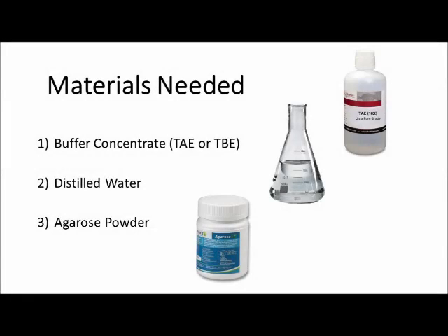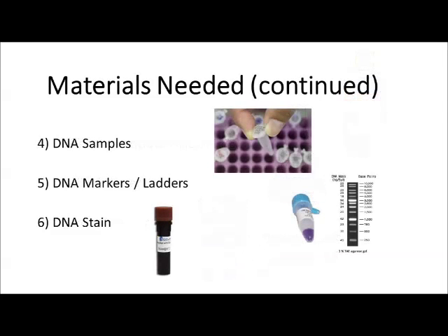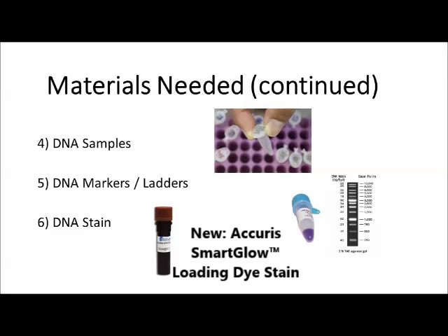Materials needed include buffer concentrate — either TAE or TBE — distilled water, and agarose powder. Also needed will be DNA samples and DNA markers or ladders. For our demonstration, we'll only be separating DNA markers on our gel, and we'll also need some DNA stain so the DNA can be visualized once separated on the agarose gel.